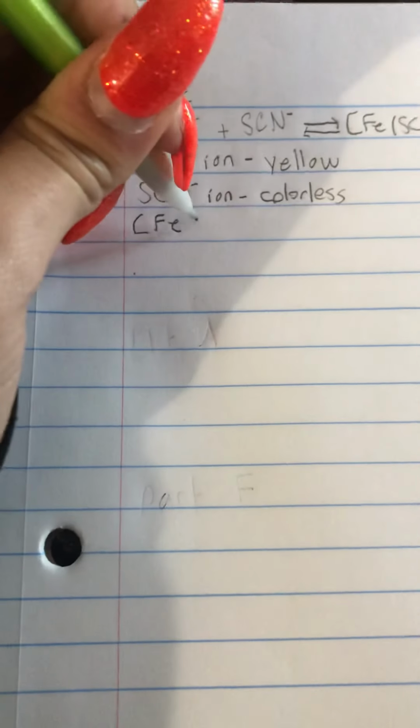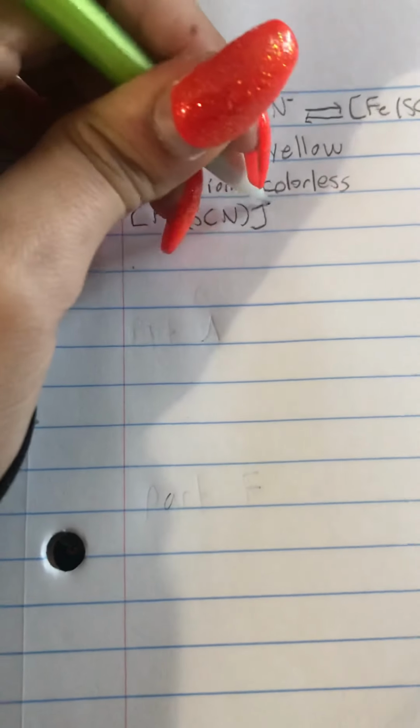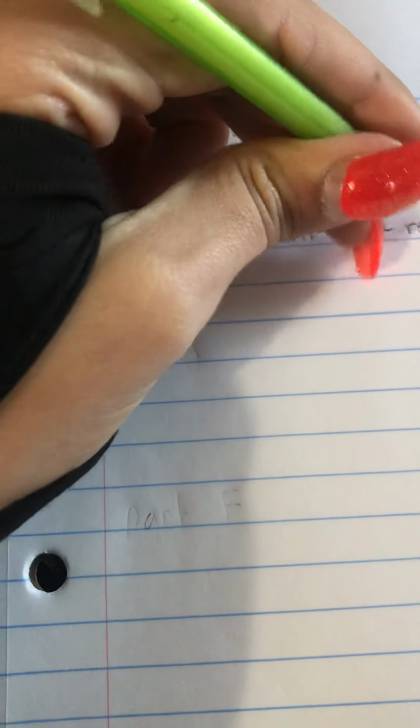And thirdly, what color is the FeSCN2+ ion, and that is a dark red color.